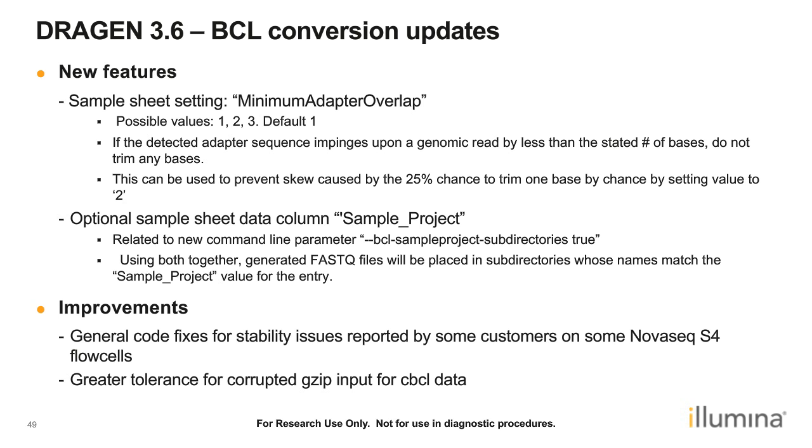So if you are taking samples from different customers who want the data returned back, you can break them down into different projects, so it's easier to manage.